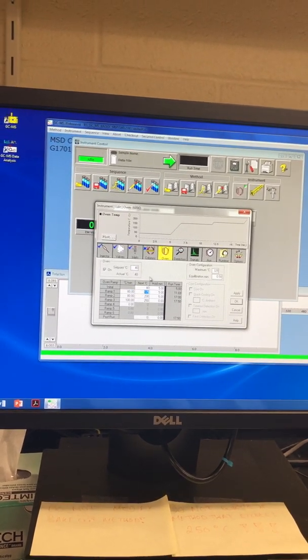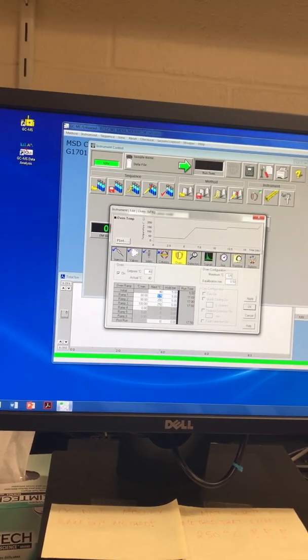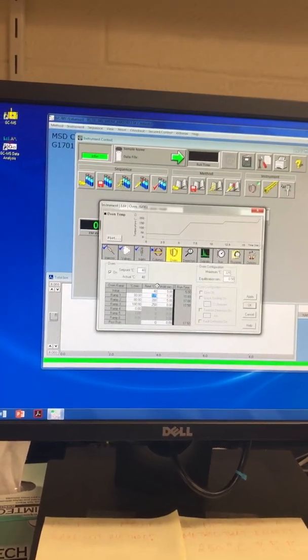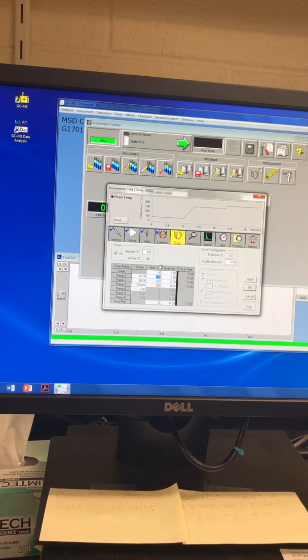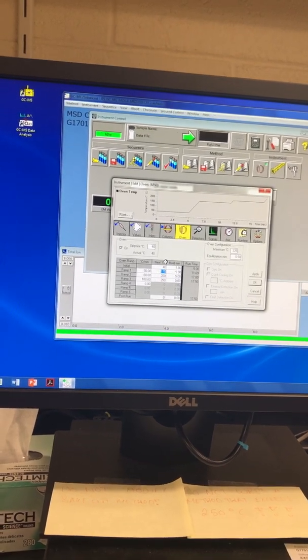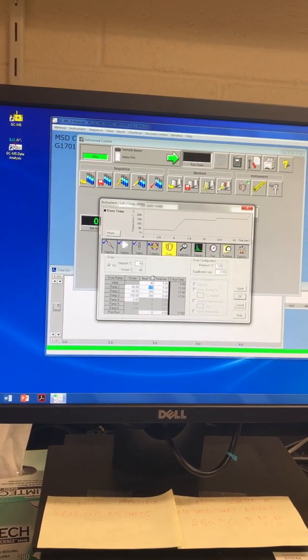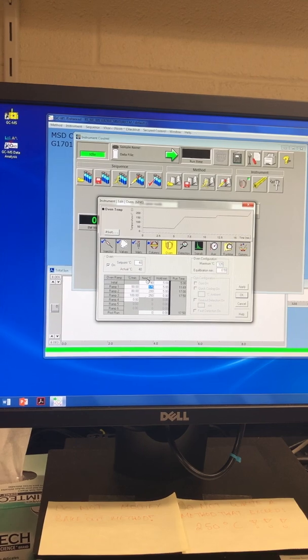So the next thing would be to have the temperature around which your first analyte should be coming off the column. So I ran each of my analytes in the solvent separately and put them through GCMS to see what temperature they would come out at in the solution when it goes through the GCMS.